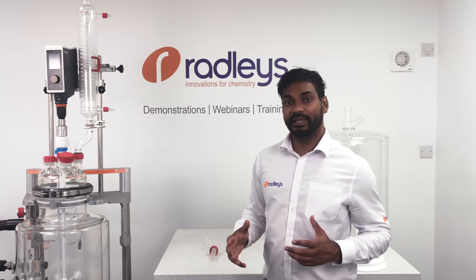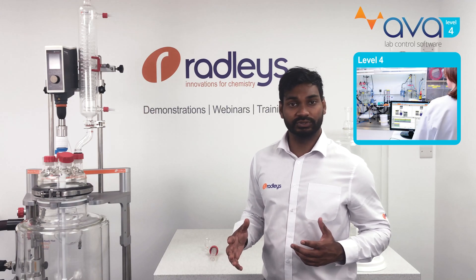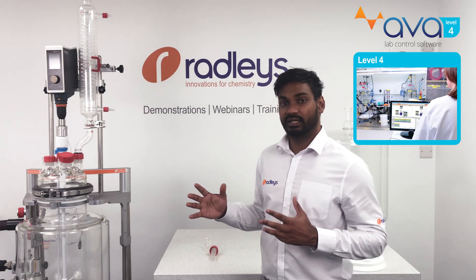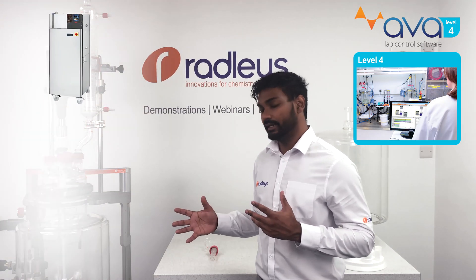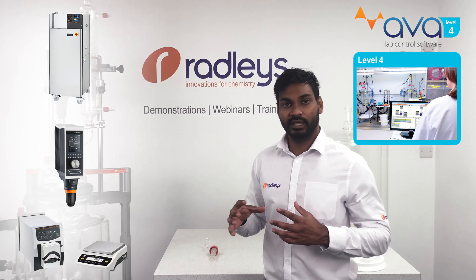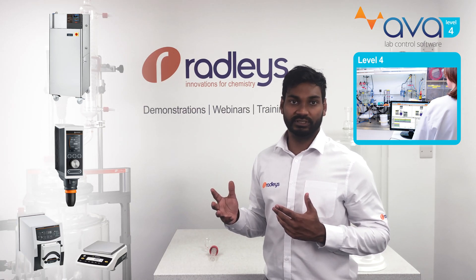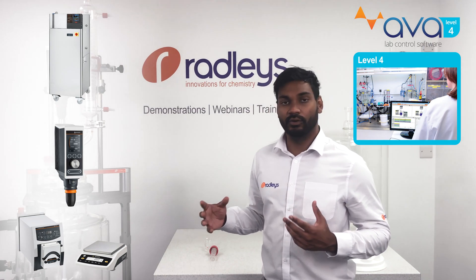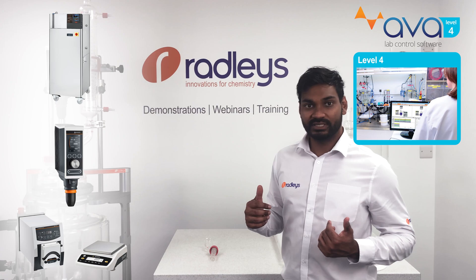You can also automate your reactor using our AvaLab control software, which allows you to data log and automate all through-put devices connected to your reactors, such as the circulator and overhead stirrer, as well as gravimetric addition modules for liquid dosing. If you want to find out more about Reactor Ready Pilot or AvaLab control software, head over to our website.